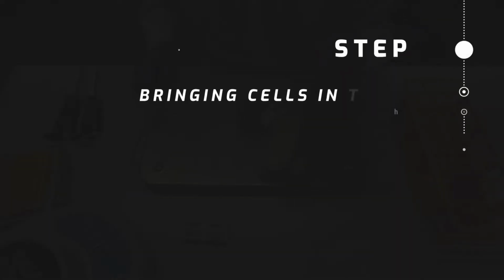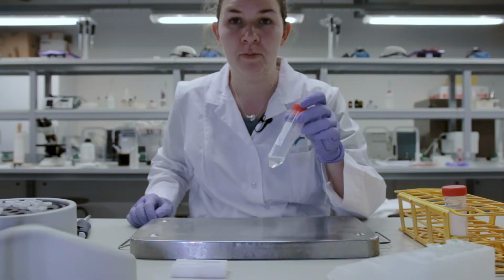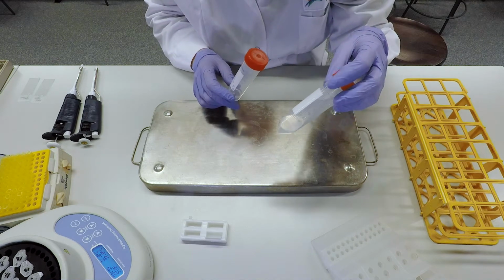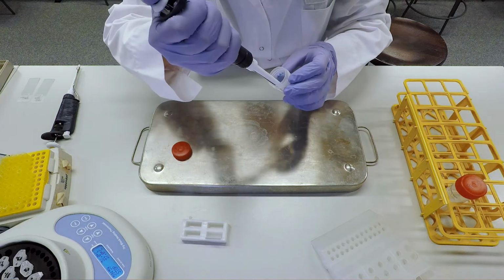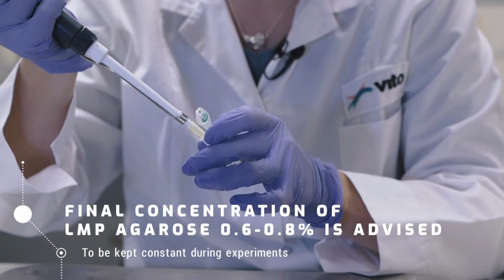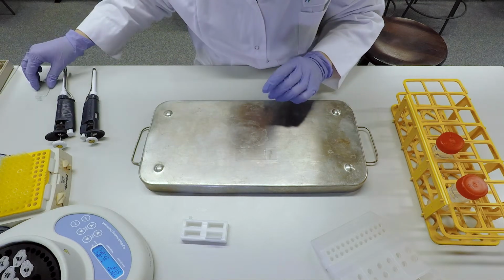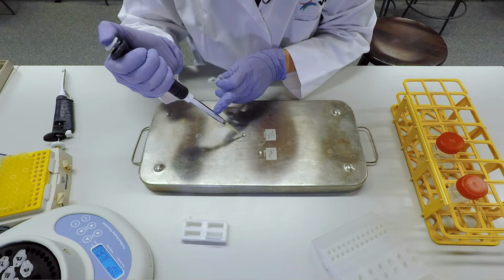Okay guys, so now we're going to put the cells in the gel. We have here granulocytes which are diluted to 1 million cells per ml in PBS. And we have another tube in which we have isolated mononuclear cells, also 1 million cells per ml. And then I will take 50 microliters of this cell suspension and mix it with 150 microliters of 1% low melting point agarose. I have the 2 slides, and on each slide I will make 2 gels of 70 microliters each.